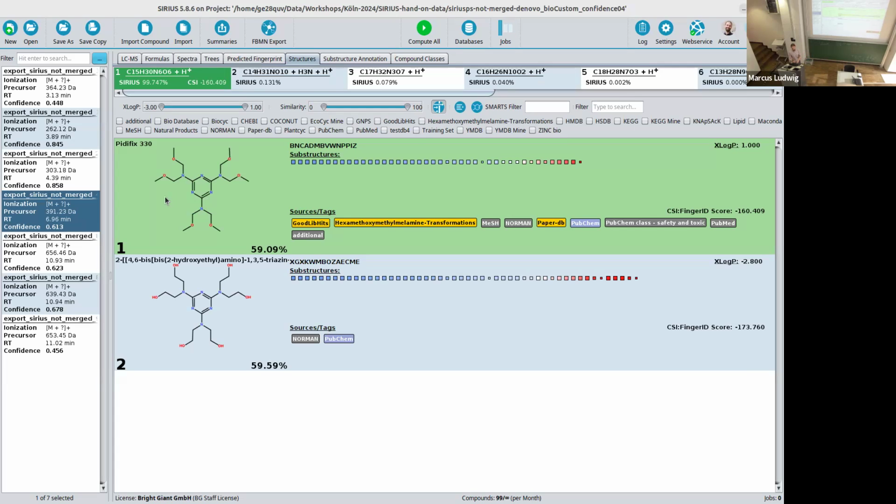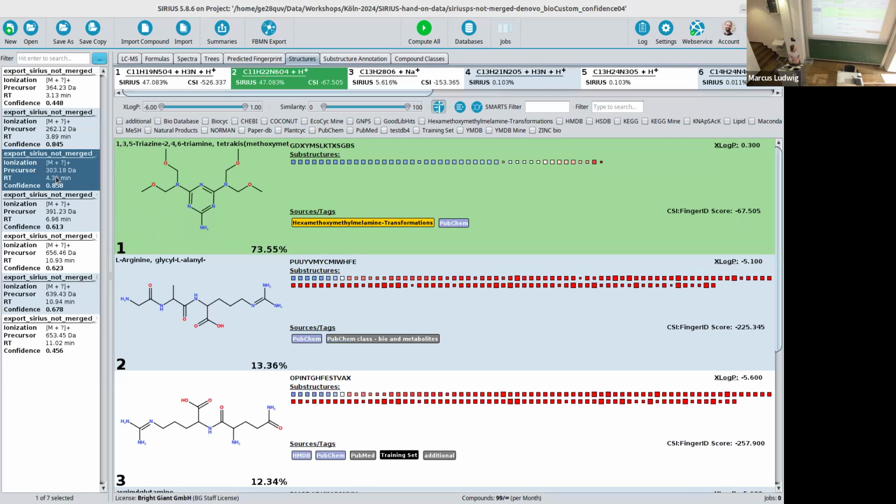You don't see it for some reason. I don't know. Maybe nothing in the end after all your setup remains for this compound. Then we want to have a way to find the biotransformations, and we did this exactly with our custom structure database. And this is one of these presumably transformations of your compound.